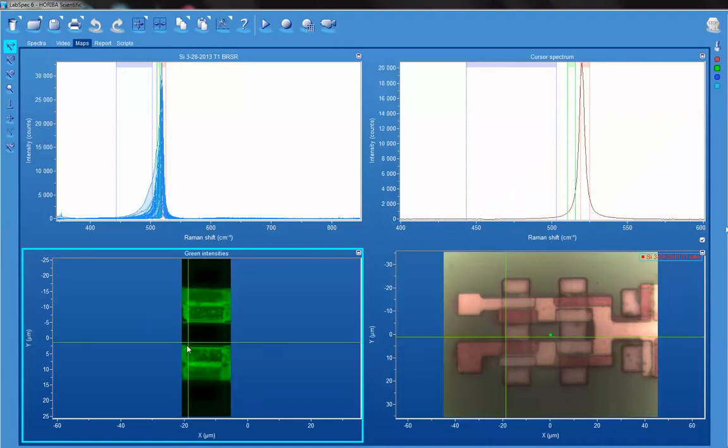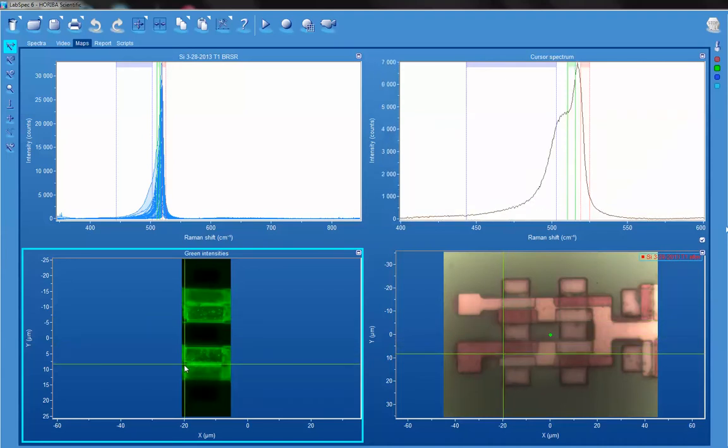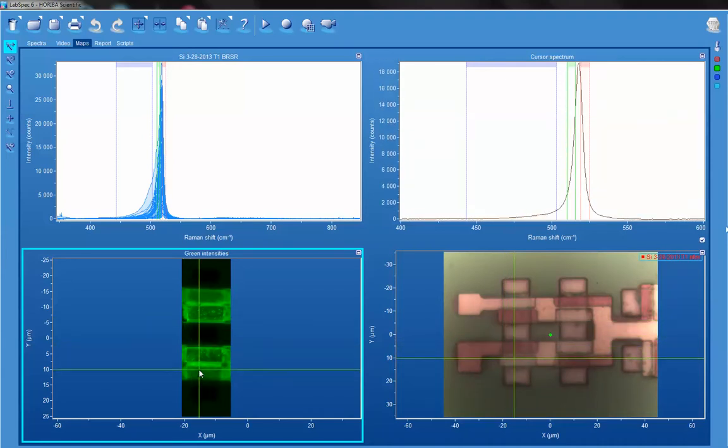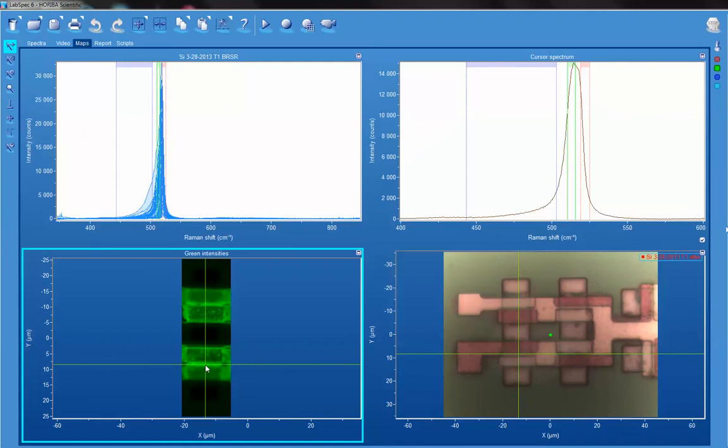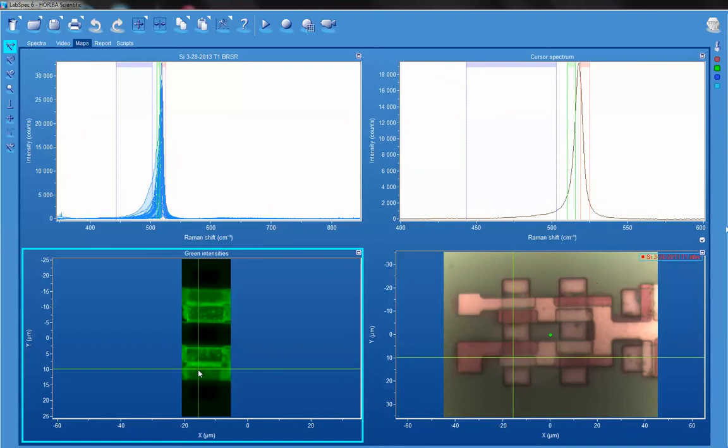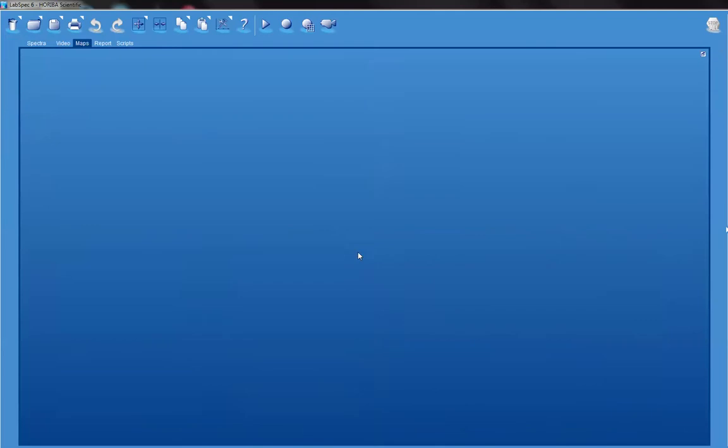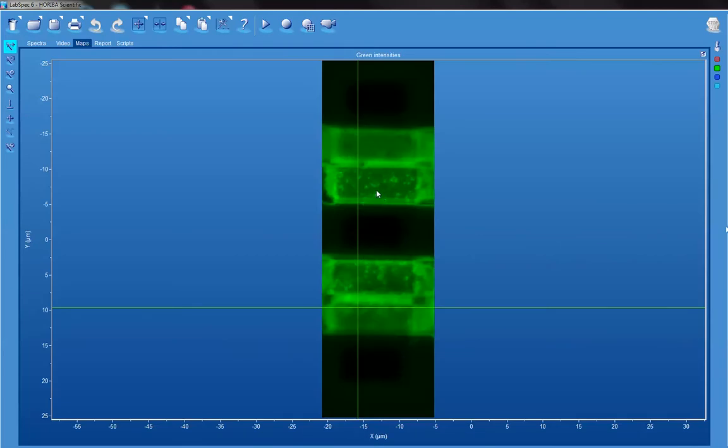To get an idea, let's look at the full image. Let's maximize our window. Now you can see those little flecks and the spatial variation in the strain and the domain size from the polysilicon.